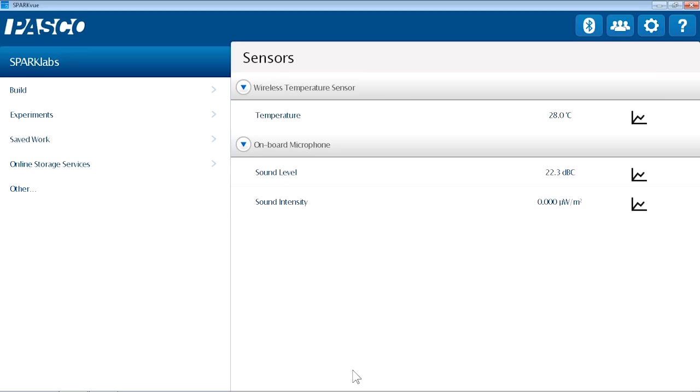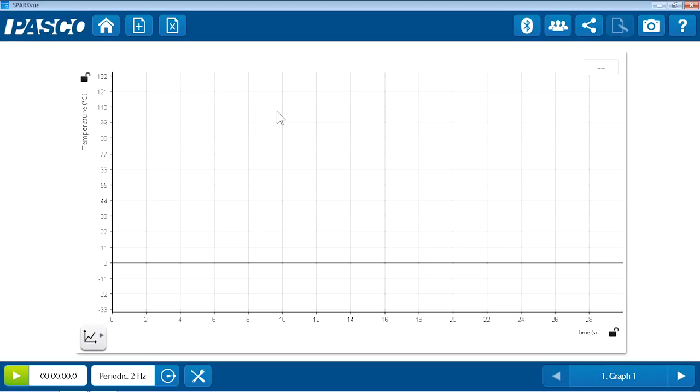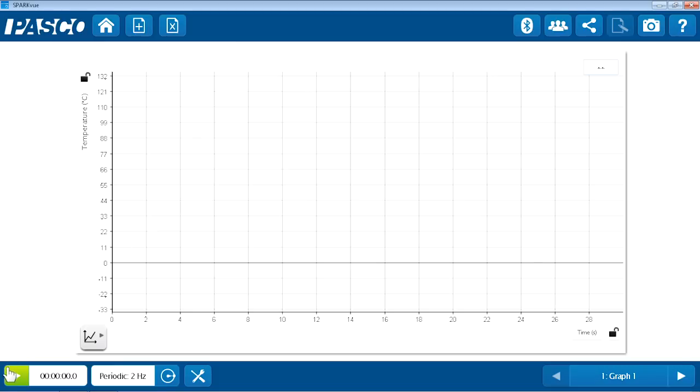Right. So on this home screen, now that I'm connected, the temperature measurement is available. So I'll touch temperature, and automatically I'm launched into a graph. And I can start collecting data.